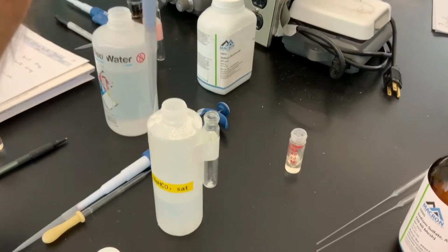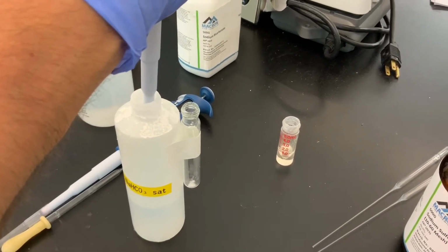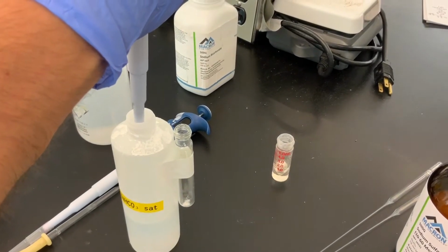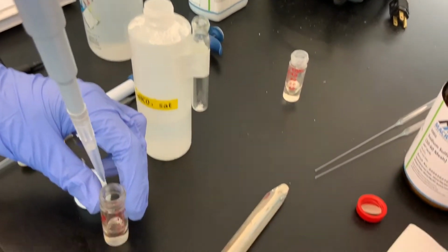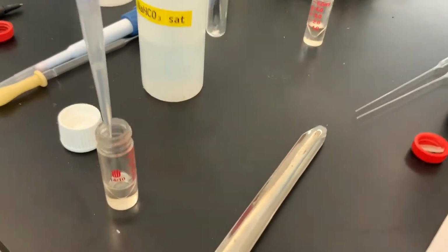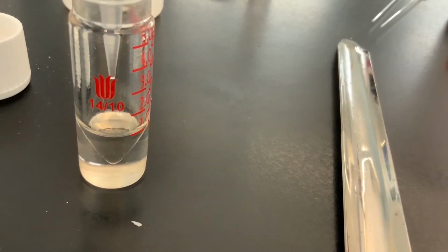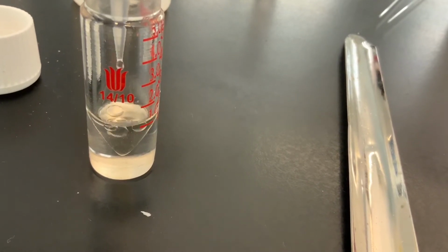Now I'm using sodium bicarbonate, so I'm going to draw up 600 microliters of the saturated solution of sodium bicarbonate, and I'm then going to add it to the reaction vial. If we get in real close and look in as I drop it in, we'll see the same effect, that there'll be more than one layer.